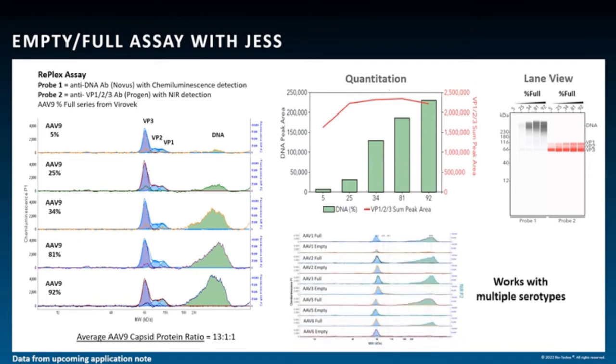Lastly, we've tested this assay with several other serotypes and observed the same general trend when comparing empty and full AAVs.